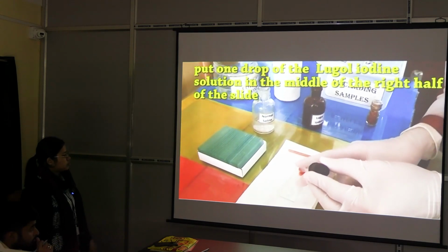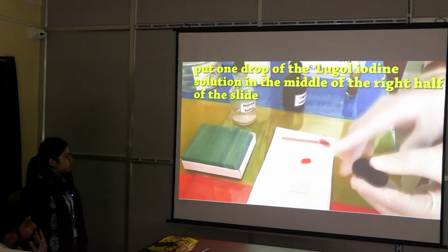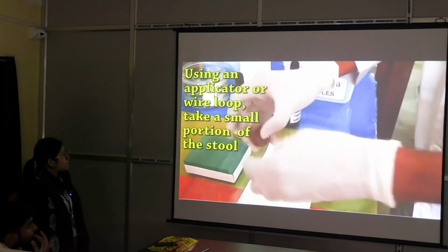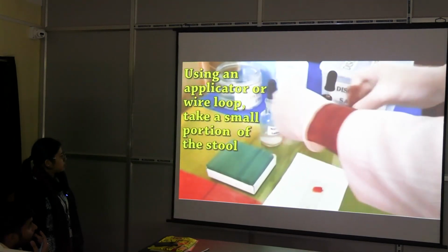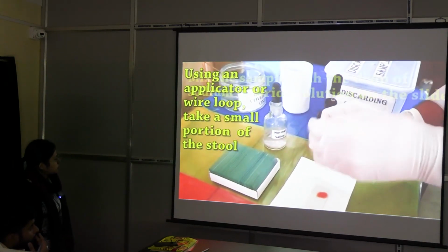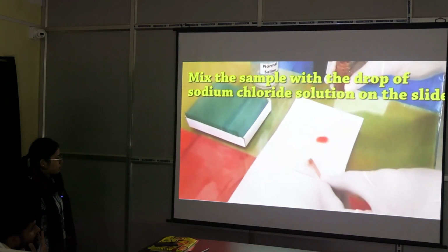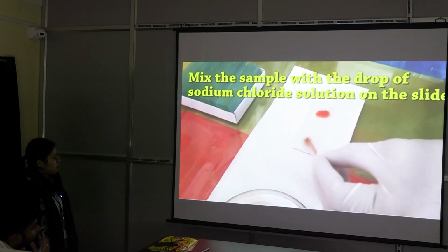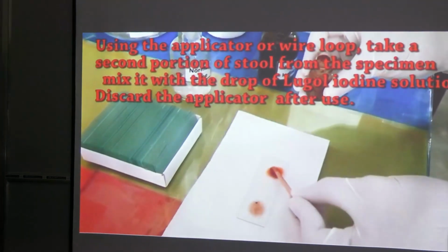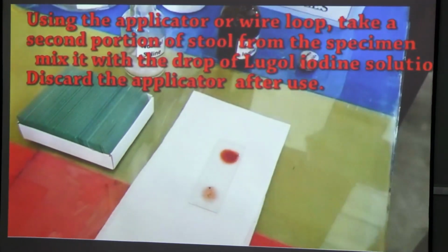You can see now, he's putting the Lugol's iodine, then he will be mixing it with the stool. See, he will be mixing it with the wooden applicator. After mixing it, we will discard the wooden applicator.